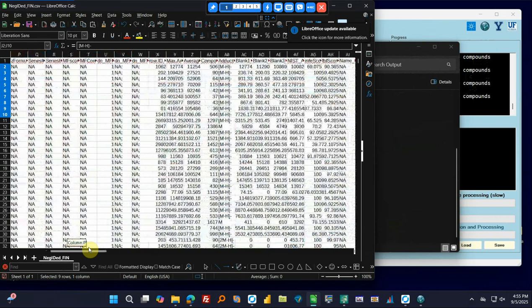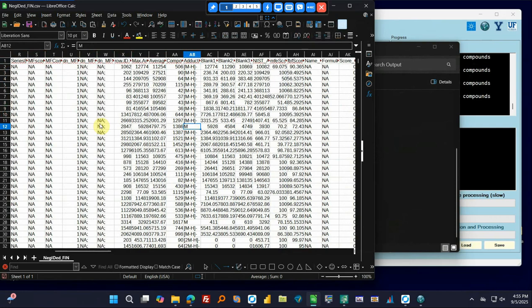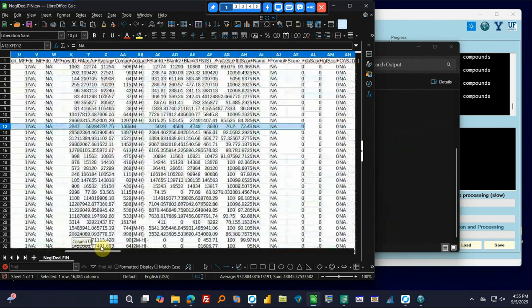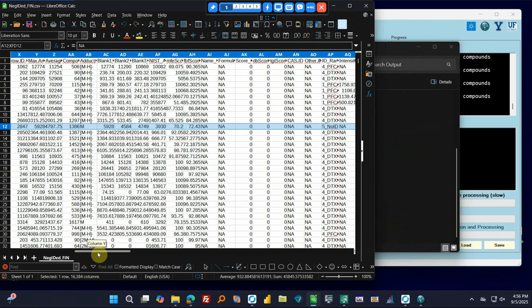And here you can see the adduct that's from the PFA files. You can see that the M ion, so the molecular ion, is also contained. And so this is going to be the compound level information with volumes, taking all those adducts into consideration and all the isotopes into one peak.